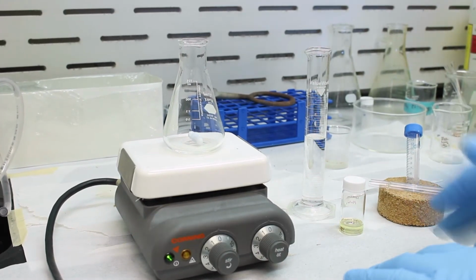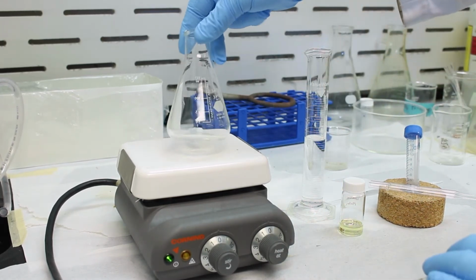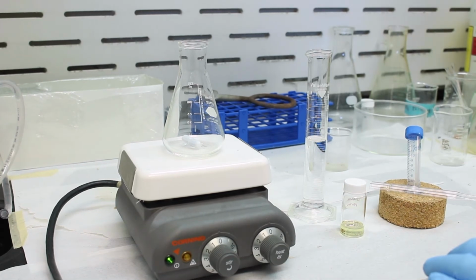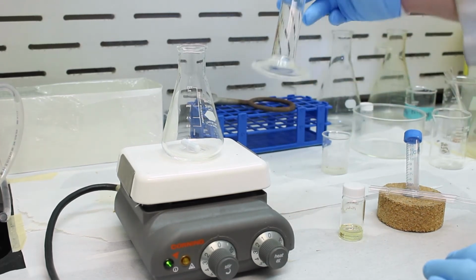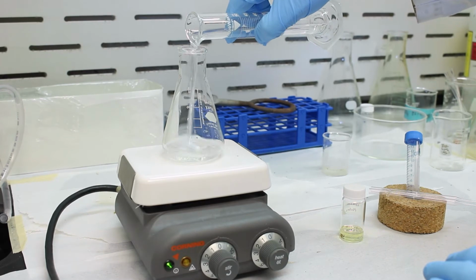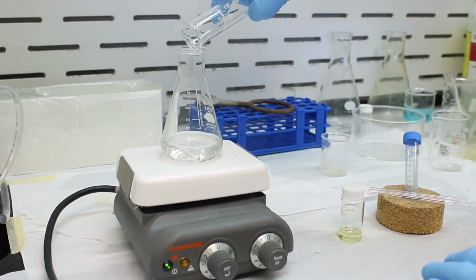Okay, so we're going to do our aldol reaction. Our reaction vessel is a 125 milliliter Erlenmeyer flask. You'll notice the setup is much simpler compared to the Grignard last week, and the addition of the reagents is also much simpler. Our solvent is acetone, so we've got 30 mLs here. So we'll place our acetone in the flask. So this is our reaction solvent.